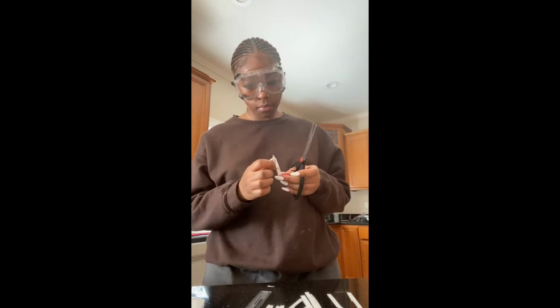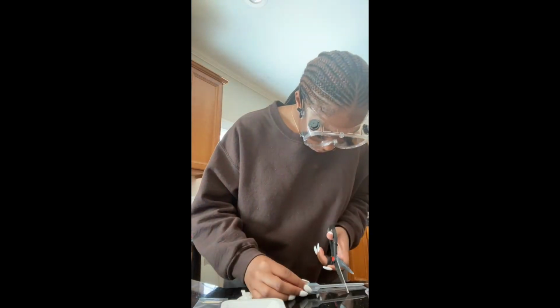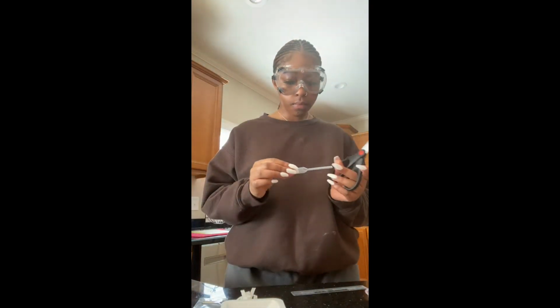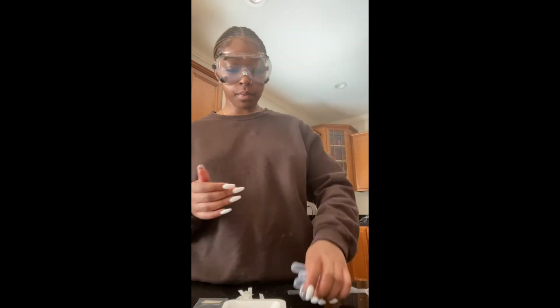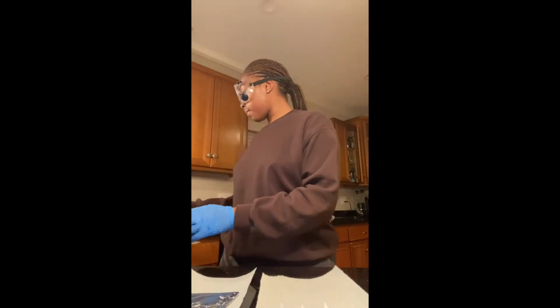So next, we want to prepare our chromatography strips. These are going to be our stationary phase in the TLC experiment. And then we're also going to prepare our pipettes. These are going to be used to transfer our liquid food dyes and our liquid Kool-Aid samples to the chromatography strip.